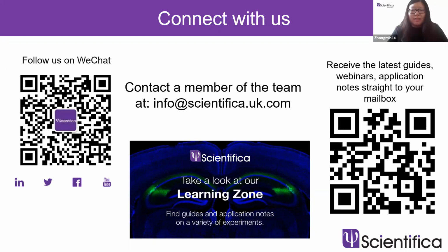Well, that really depends. I can share my own experience. It's really frustrating at the beginning when you're trying to do the craniotomy, it's a really difficult learning curve. But once you've mastered it, and you're really careful, and also pay great attention to post-surgical care, you take care of your animals, and you will get great returns.